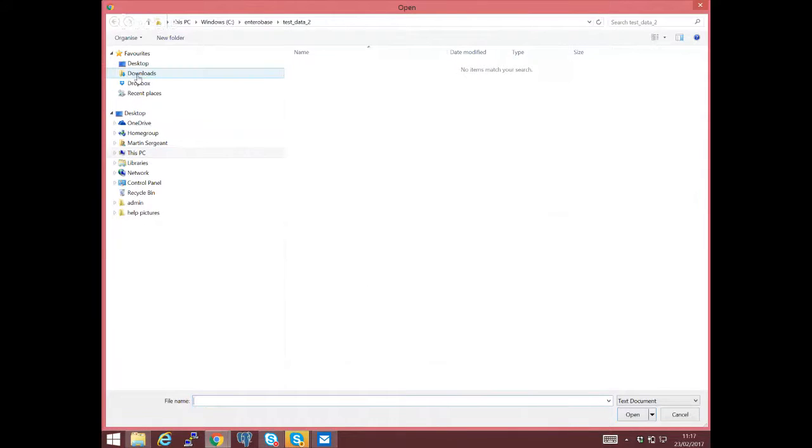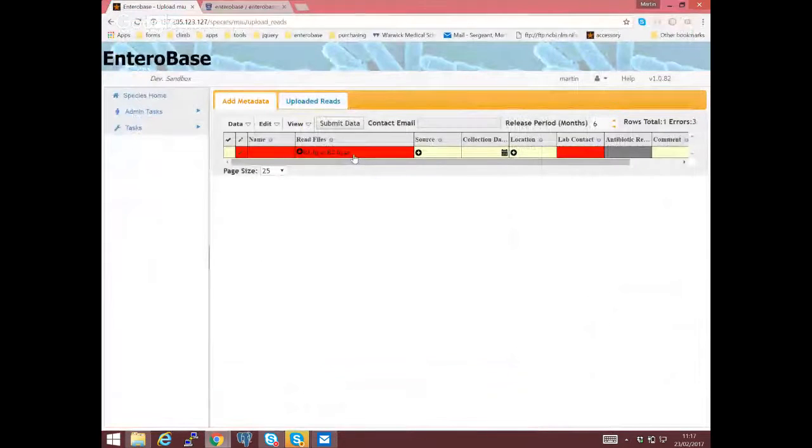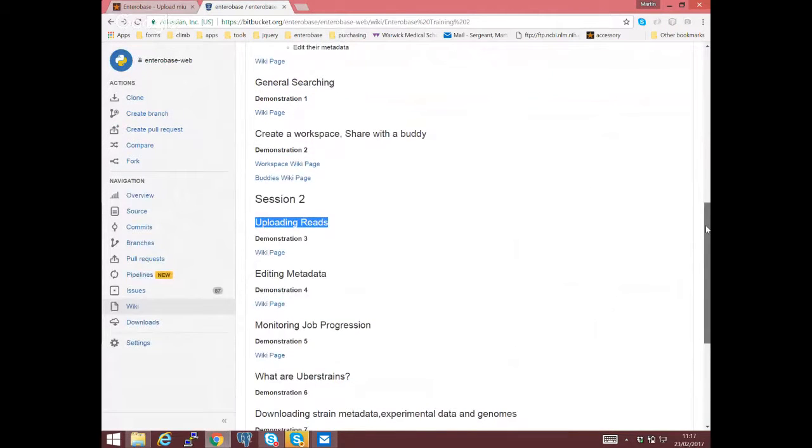If we upload it now, we can see it's uploaded. I think people use a script or something so they can associate all their FASTQ files with the appropriate metadata, and then they can upload it. Okay, so that was uploading reads.